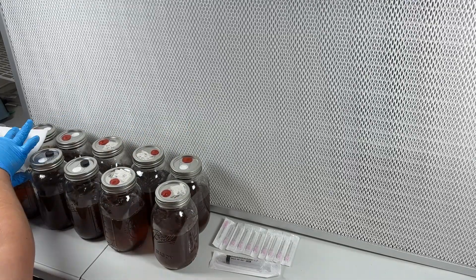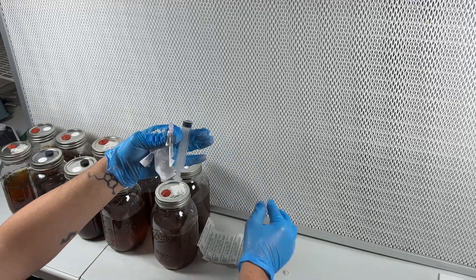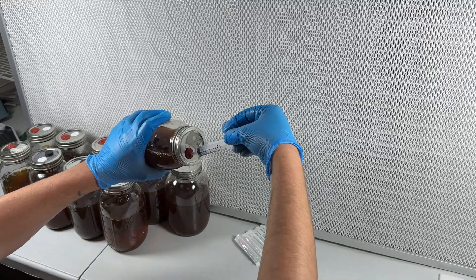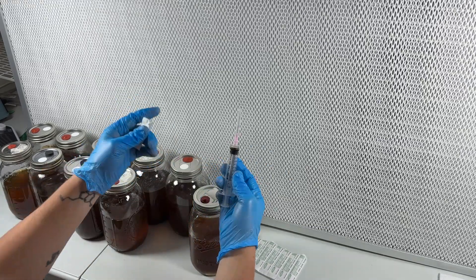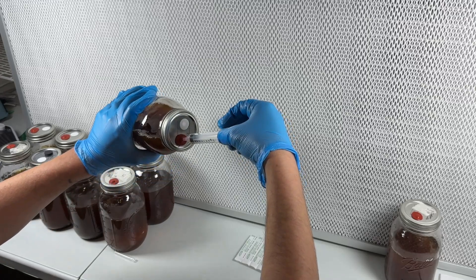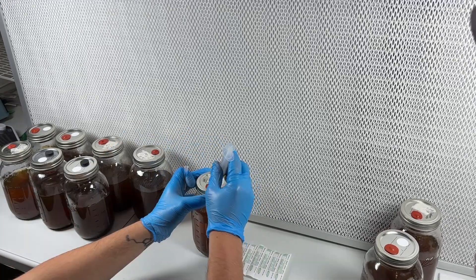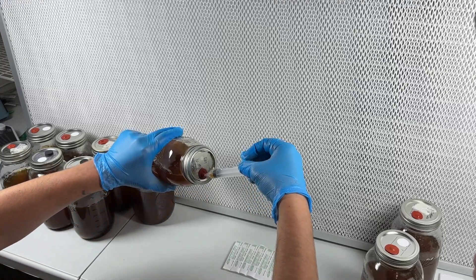In this example I'll be testing 10 jars of Lion's Mane liquid culture. Here I'm using a sterile syringe and needle to extract around half of a milliliter of liquid culture from each jar, using a new needle between jars. If you want, you can take a chance and flame sterilize one needle 10 times. By combining a tiny bit of liquid culture from each jar into one syringe, I'm able to test the syringe to see if contamination is present in one or some of the 10 liquid culture jars.